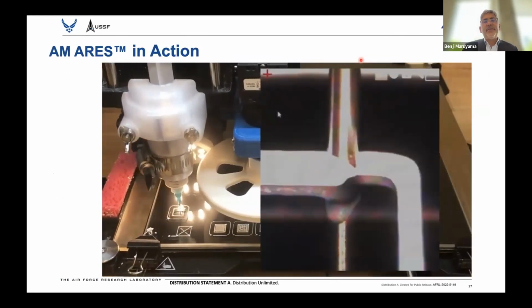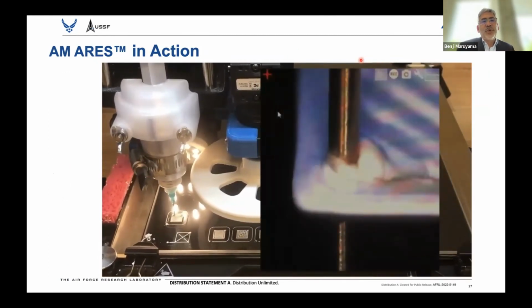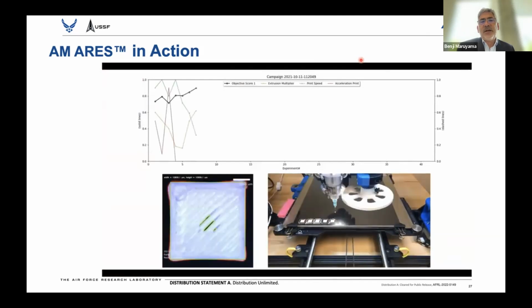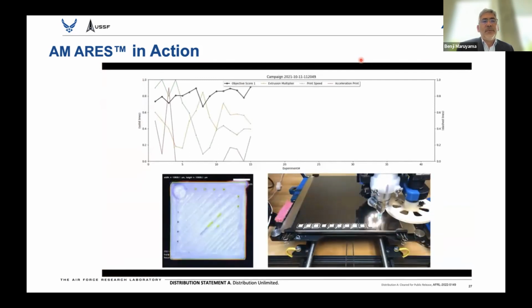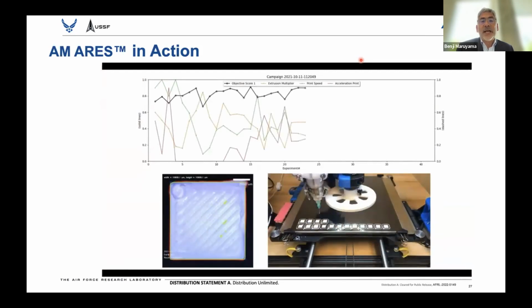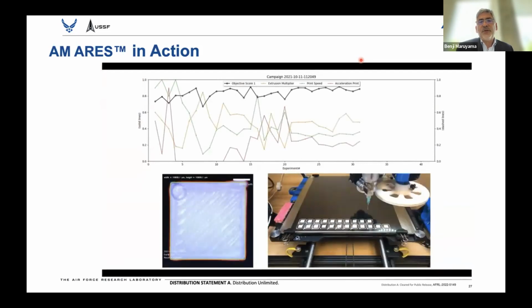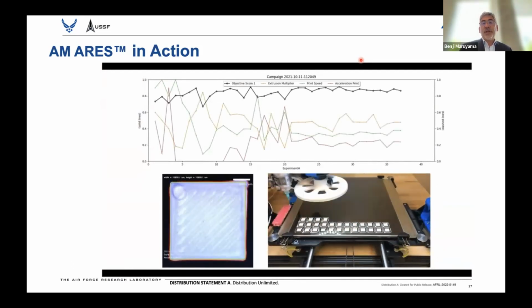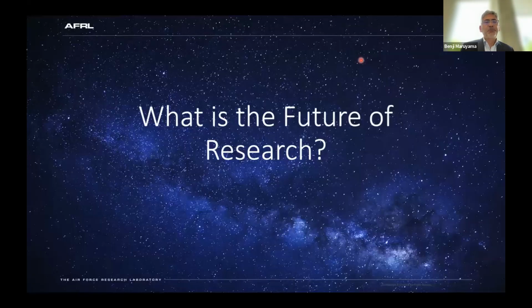So here I'm showing our additive manufacturing Ares, or 3D printer Ares, in action. It's printing out a square, in this case with latex, and then it has a camera, takes a quick picture and does an image analysis to see how well it filled in that square. And so we're able then to change the 3D printing parameters for each iteration to try to learn how to print in terms of things like the extrusion multiplier, the print speed, and so forth. And you can see after tens of experiments, it's taught itself how to print over a fairly simple structure. So that was an exciting result for us.